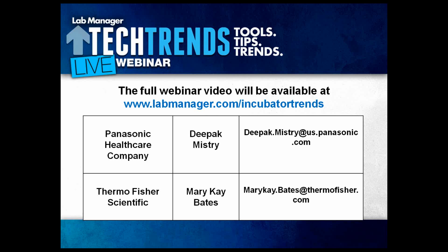And do that before looking at the cost differences, because at the end of the day, you don't want to buy a technology or an incubator where you have to replace the sensor, because some sensors for some manufacturers could be expensive, and it just becomes an issue. So I would say research, research, research when evaluating these technologies.